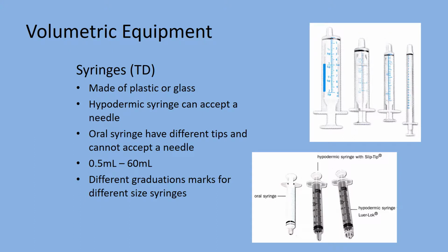Syringes are designed to deliver. So definitely in oral syringes, in the tip, there'll be some remaining. And even in the IV syringes, there'll be some remaining. So don't pull back on the plunger and then try to blow out every last drop. You would then administer a little bit too much.